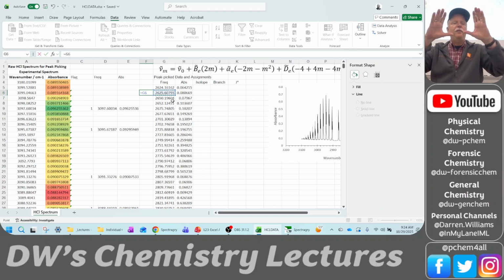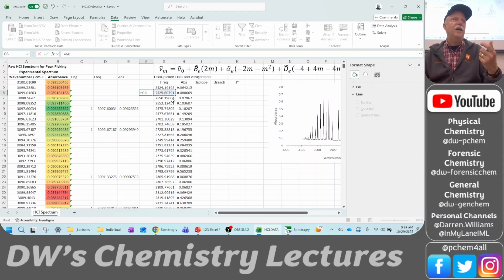Whenever I was hitting sort, it was dropping down 3097, treating it as a header. Yeah, and so I was fighting with that. I had to sort it like 3 times to get it to not do that. Eventually, I had to select frequency and absorbance as headers and select the data. And when I was using Control Down, it was also getting all of those double quotes, and I didn't want those. I just wanted the numbers. So I also had to fight a little bit to get the numbers to sort. But that'll be in the video. I wanted to narrate why I was having so much trouble.